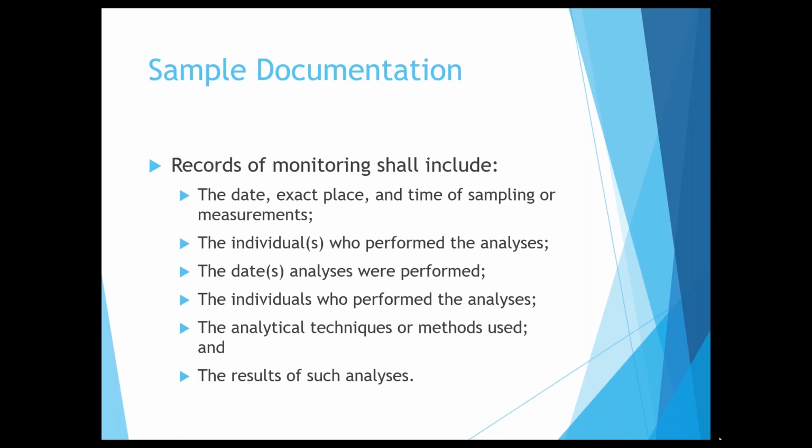DO really should be measured in situ, because unless you can collect it gently to not introduce any air, you really should measure DO in situ. pH, you can collect it and measure it within 15 minutes. But fecal coliform, that one must be collected in the container that it's in. And do not rinse this container with bleach. Don't try to clean it out and put the preservative back in. Don't do that. The lab sends you a container. They want the sample collected in that container.